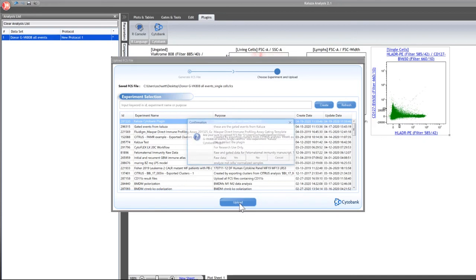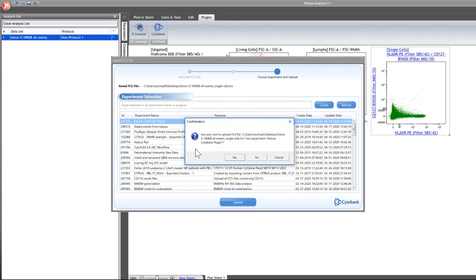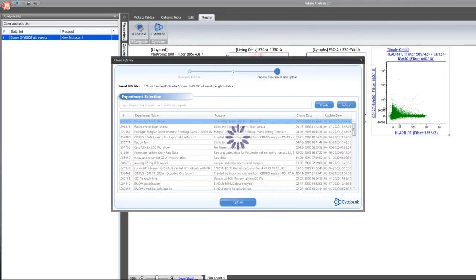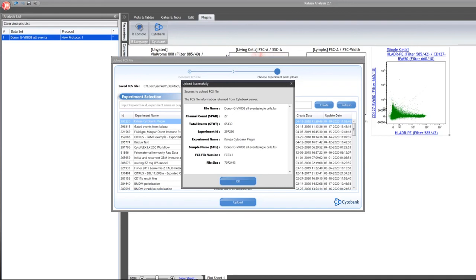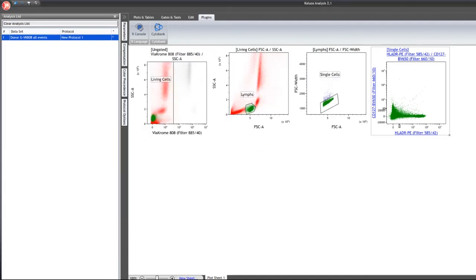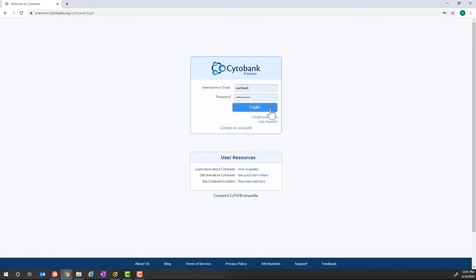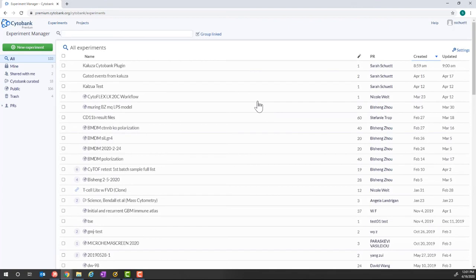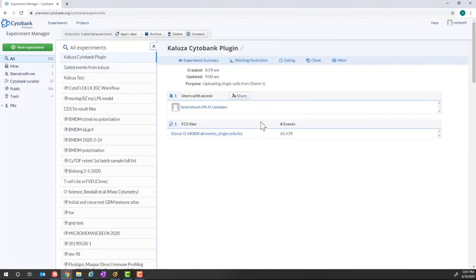Click upload, confirm that you want to upload the data files into the cloud, and the upload process will begin. Once the file has uploaded, you will see the upload success confirmation. You can then go into the Cytobank platform to begin running machine learning algorithms on your pre-processed data. Logging into Cytobank loads the experiment manager, where the new experiment is visible. Clicking on the experiment confirms the data file was uploaded with all of the single cell events.